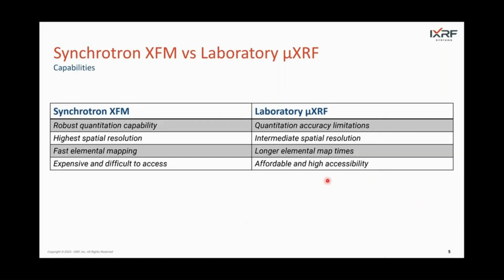So there are some very real performance differences between synchrotron XFM and lab-based micro-XRF, such as quantitation capability, spatial mapping resolution, and the time needed to acquire these elemental maps.